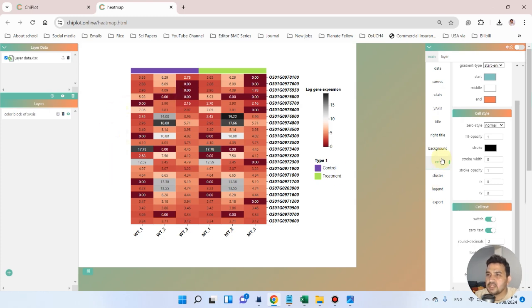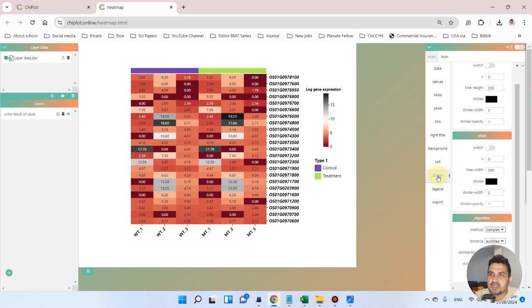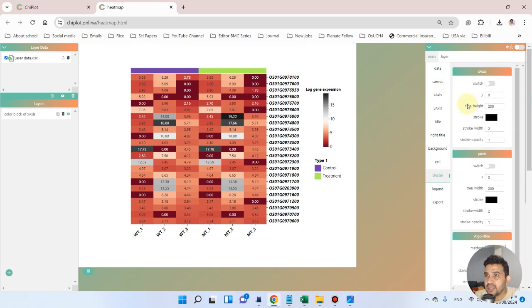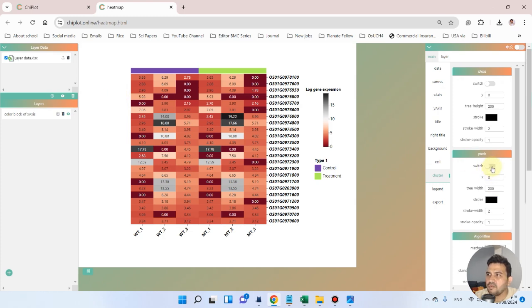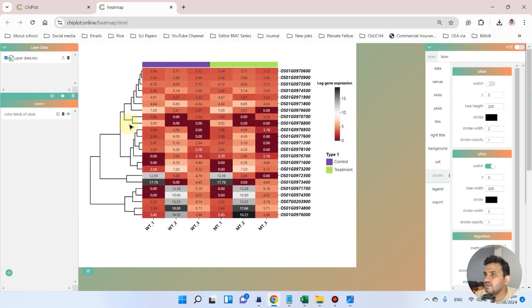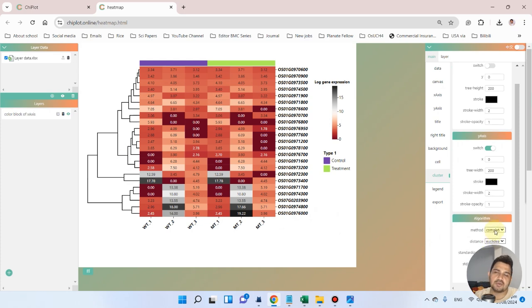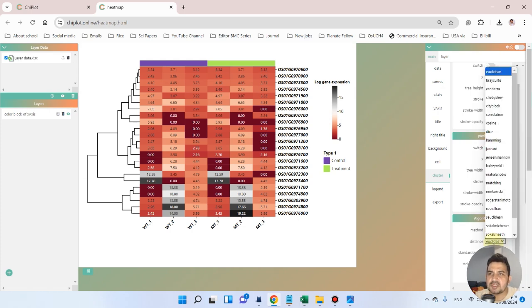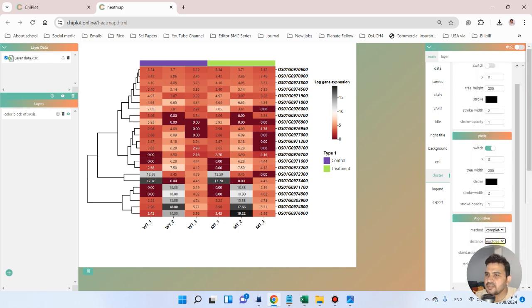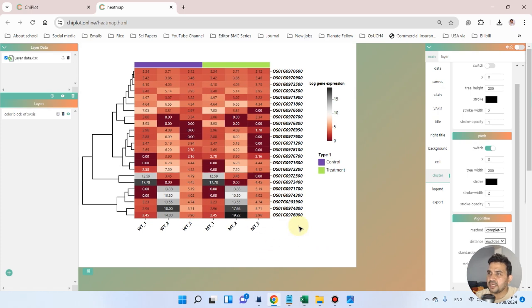Lastly, we want to cluster genes based on their correlation. Go to the clustering method option. We want clustering on the x-axis. You can see the clustering has been added. You can change the clustering method, but I recommend leaving it at the default — the method is 'complete' and we mostly use the distance method Euclidean or correlation. For standardization, we are focusing on the column direction.